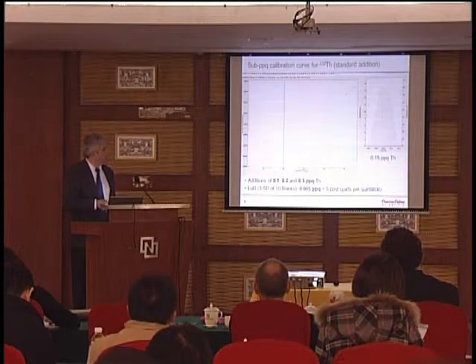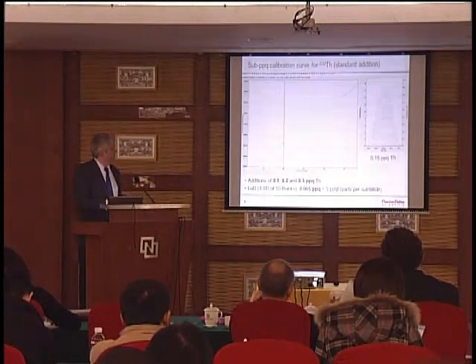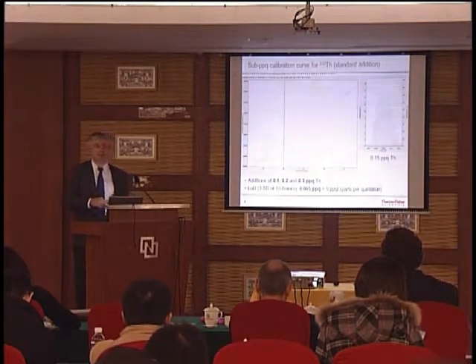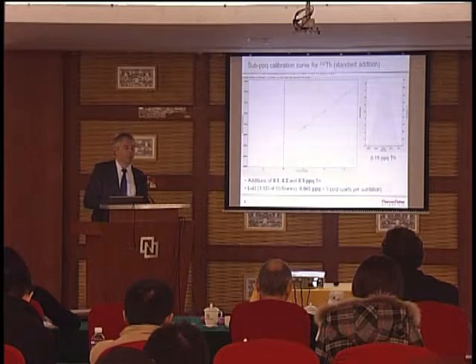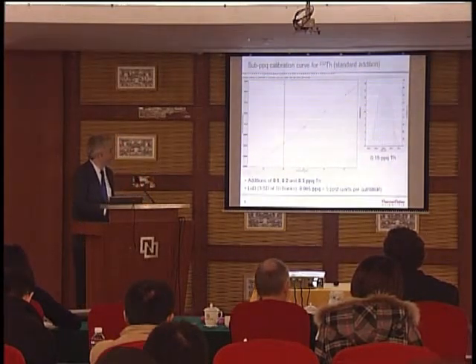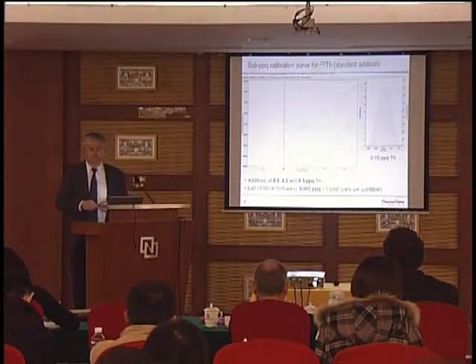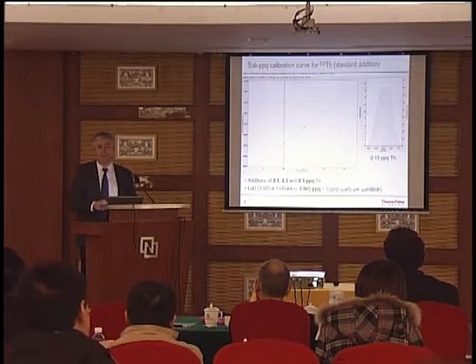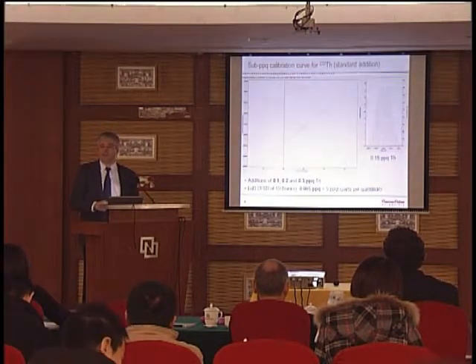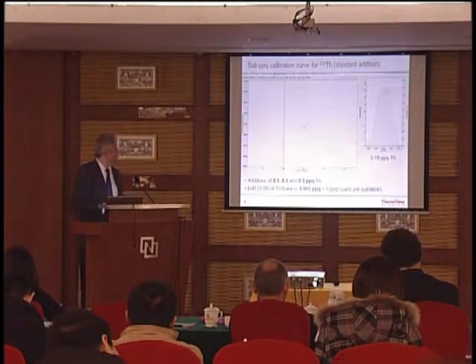So, calculating now the limits of detection by these measurements, you will find that the limit of detection is 0.005 ppq. And honestly, we had to look on Google and Wikipedia to find what is the next dimension, and we learned it's ppqt, so it's parts per quintillion. So detection limits in the range of 5 parts per quintillion. As said, 20 years ago, I think it was not in the requirements list.